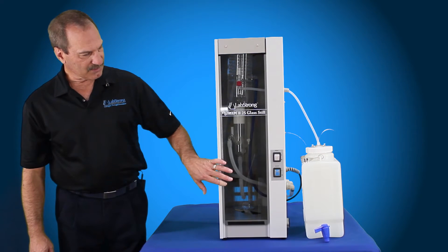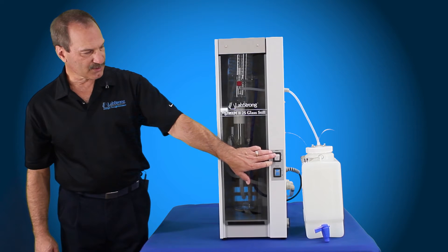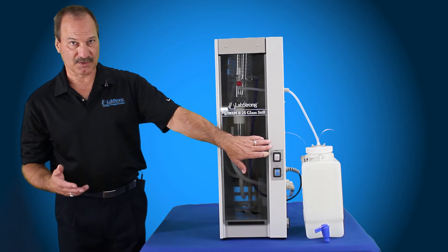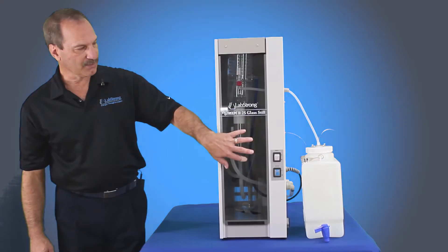To operate the system, you're going to take the power switch and flip it to the on position — it's a rocker switch. When you flip that to the on position, that's going to turn on the solenoid valve, the tap water solenoid valve, and the pre-treat if you have the pre-treat connected. It's going to energize those two and let water into the system.